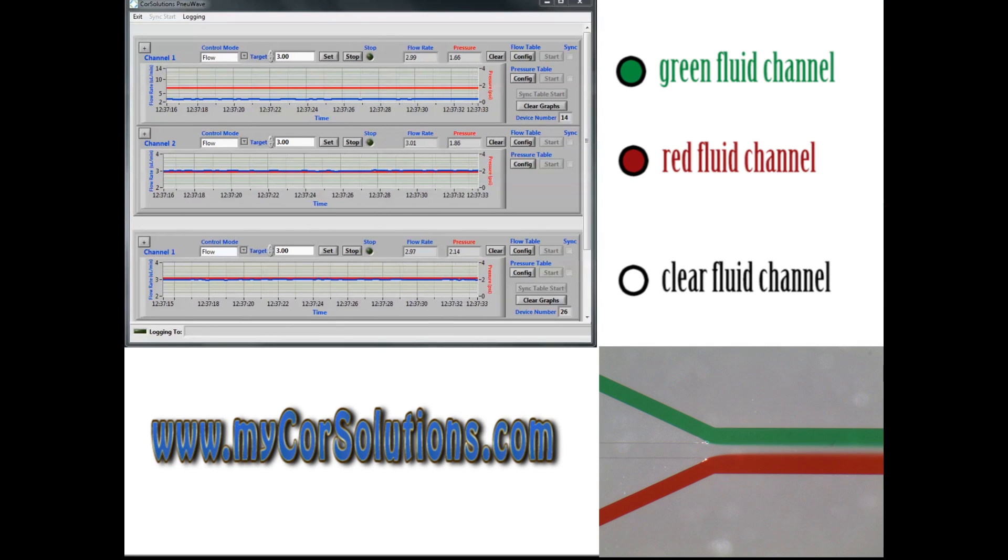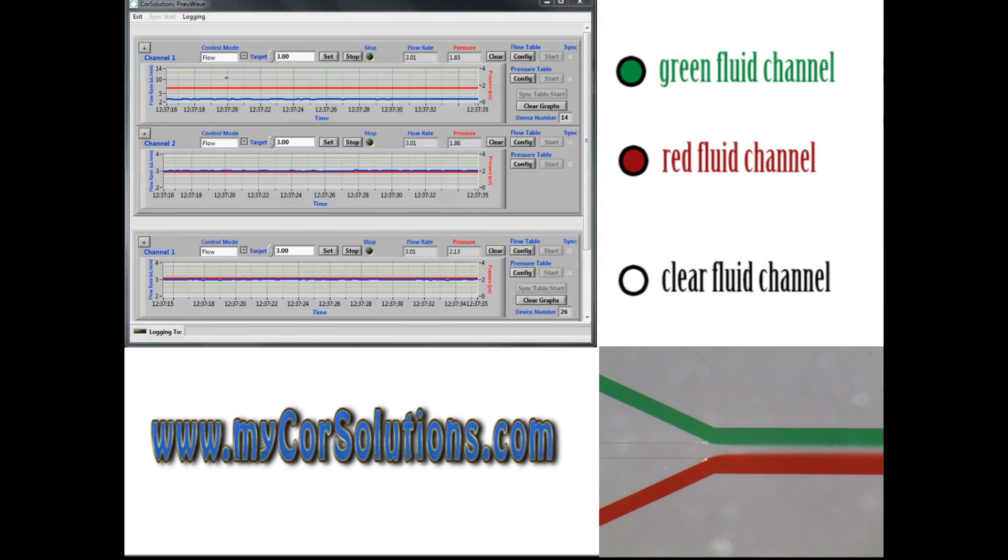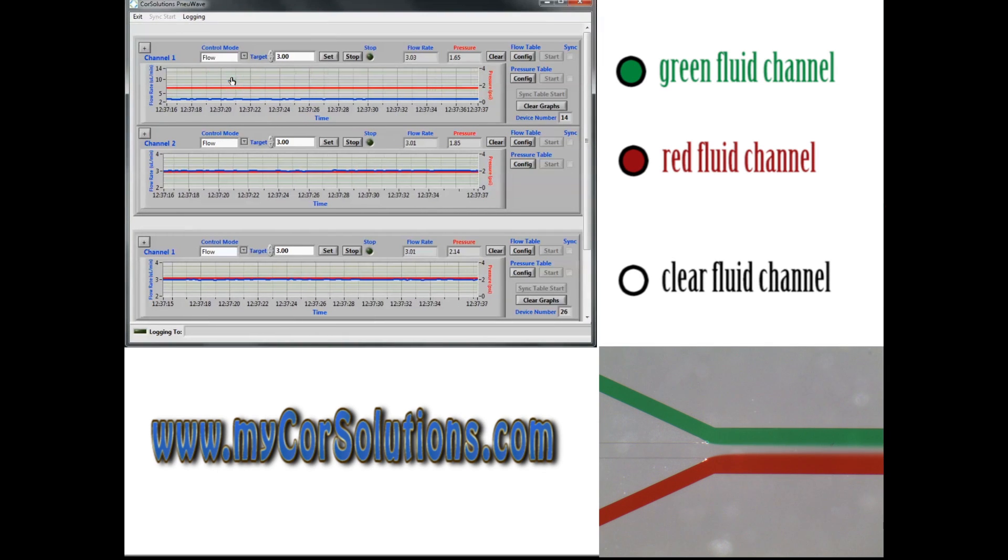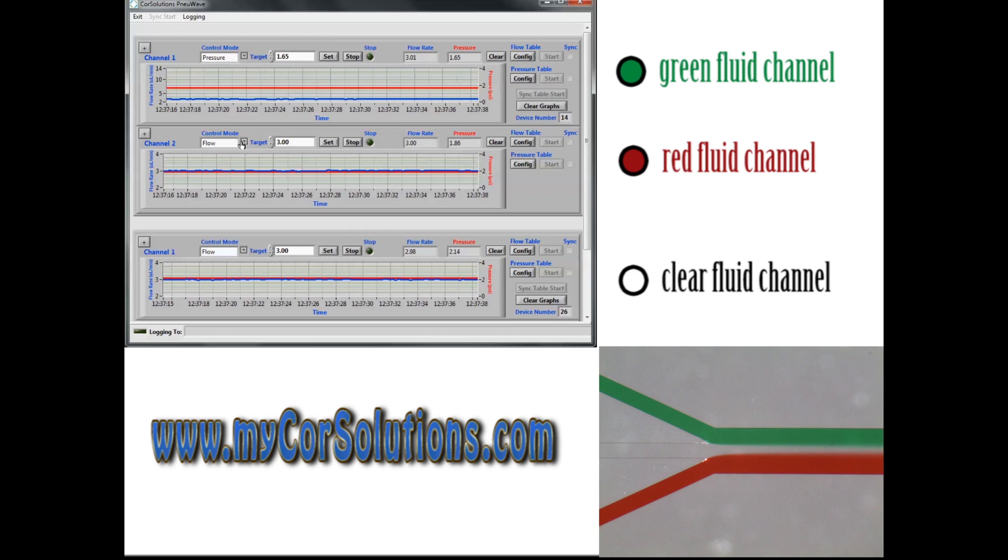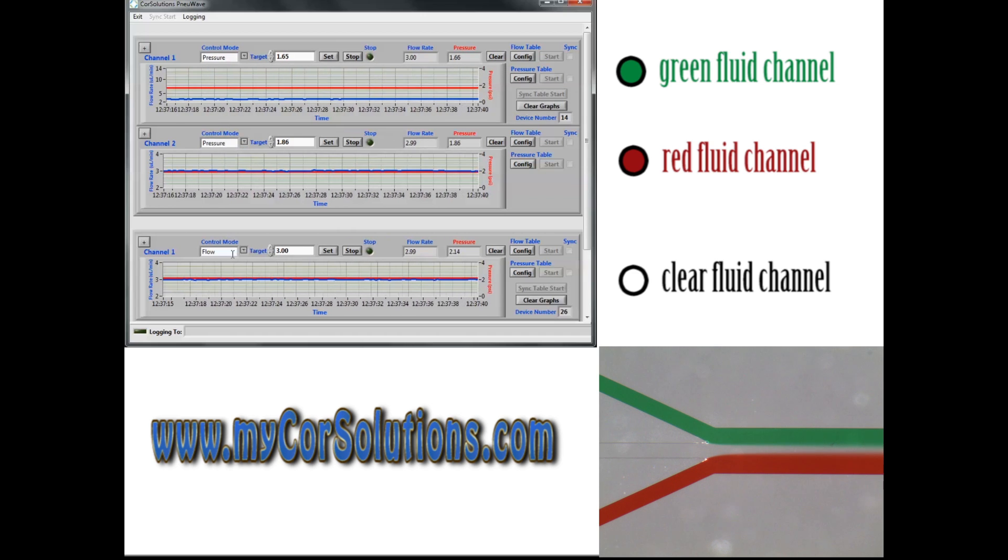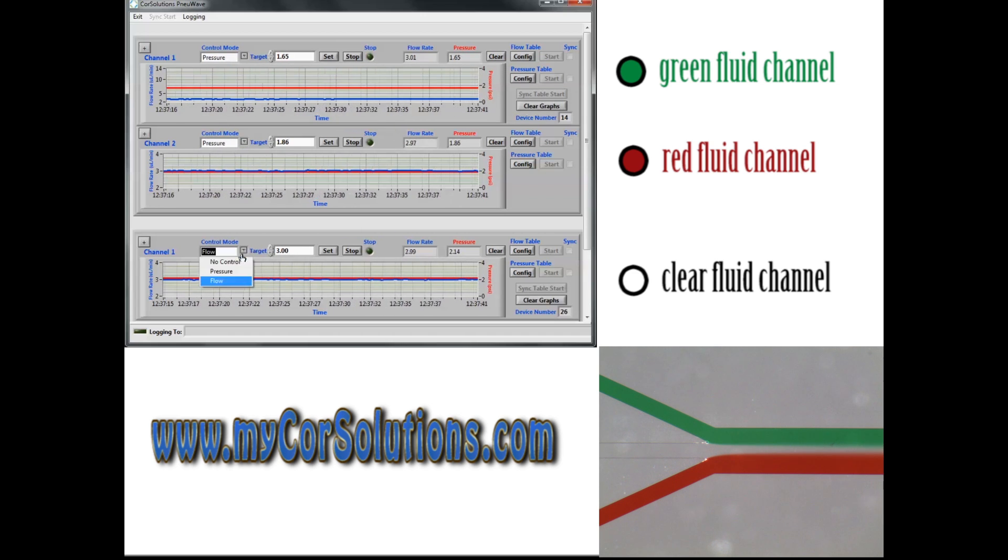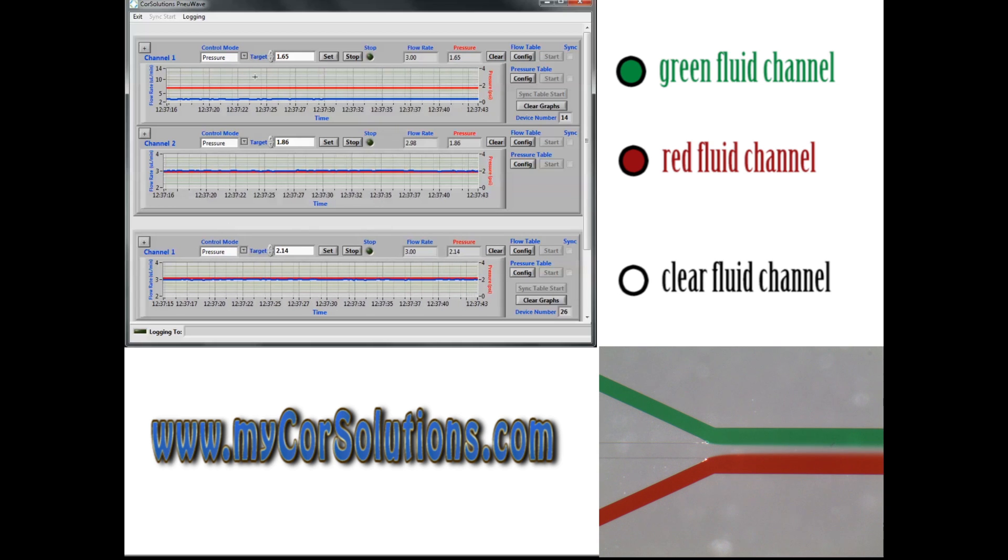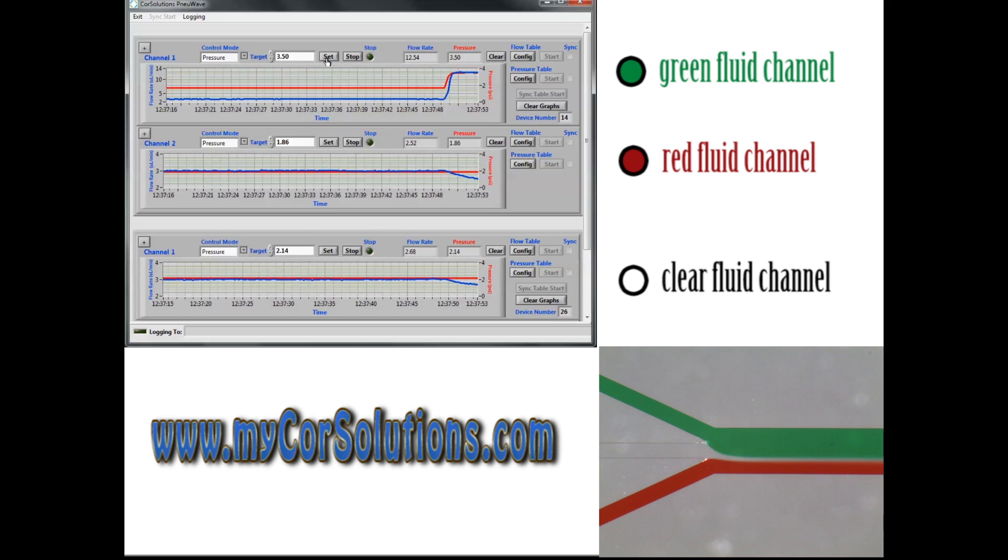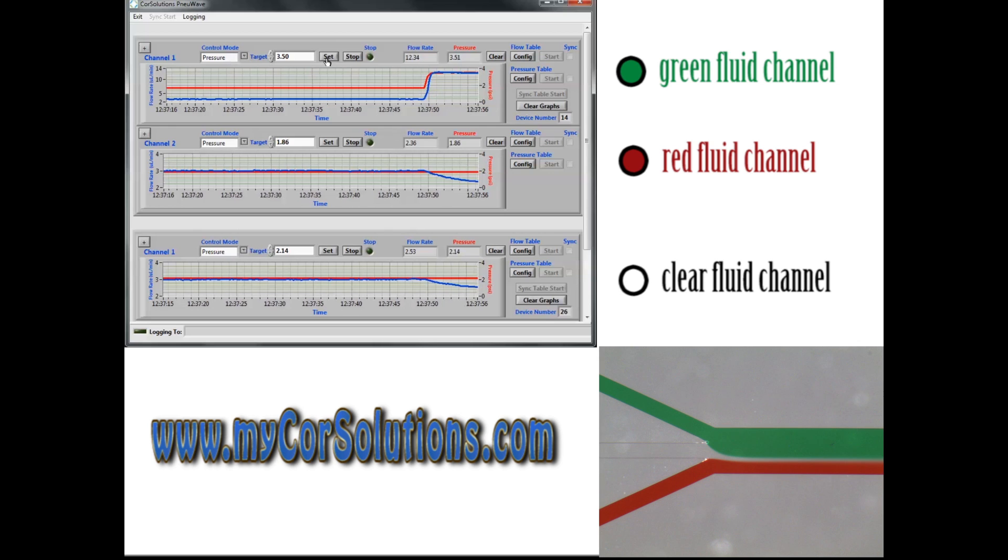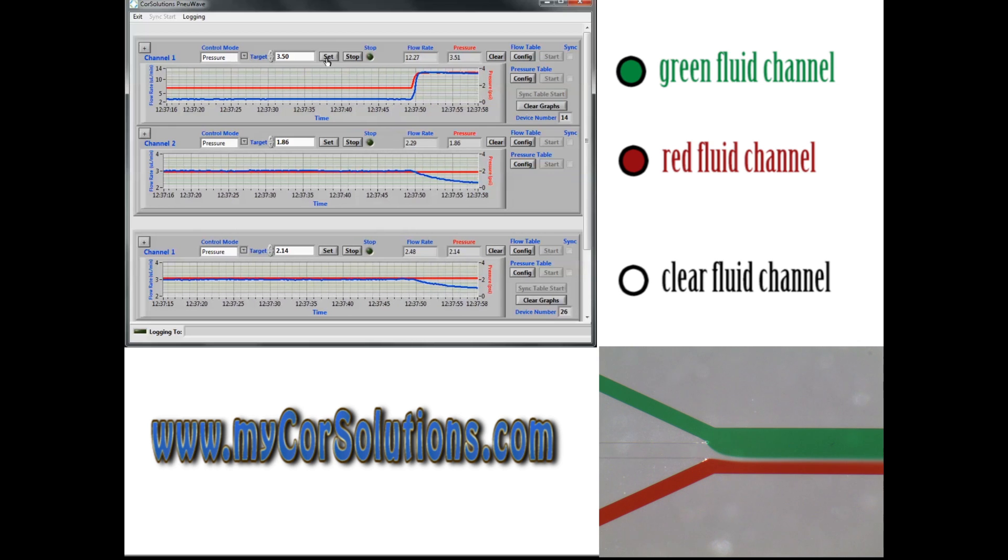Let's now compare the results obtained using flow control mode, which was used in this previous experiment, to those from pressure control mode. In this next case, we will observe how controlling pressure affects flow rates. This video demonstrates the drawbacks associated with fluid delivery controlled by pressure.